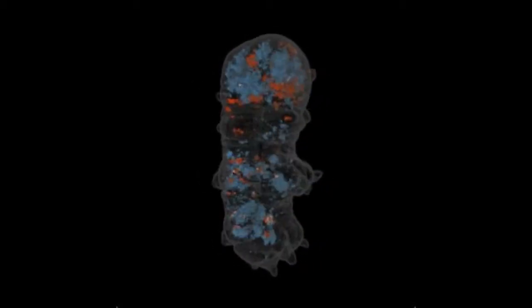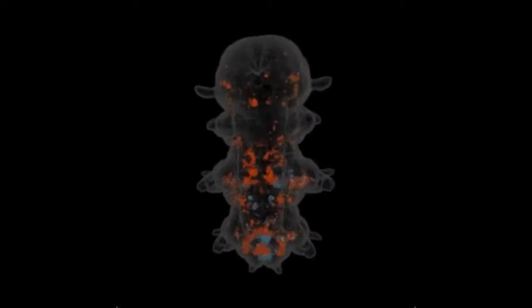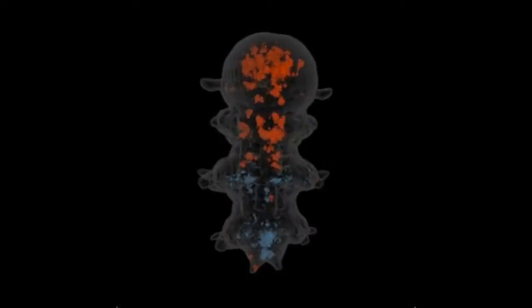This video shows a 3D model of a marine bristle worm called Platinoreus dumaryllii. A technique called whole-mount in-situ hybridization allows researchers to pinpoint the cells where certain genes are active, creating a map of gene expression for the entire organism.